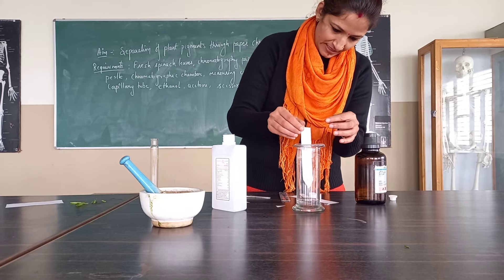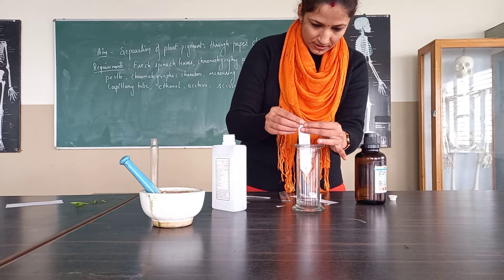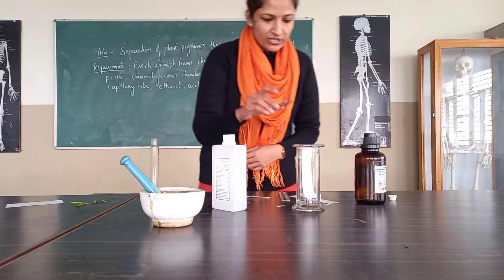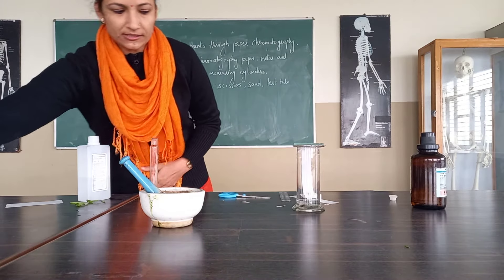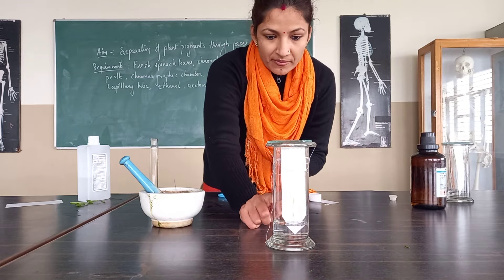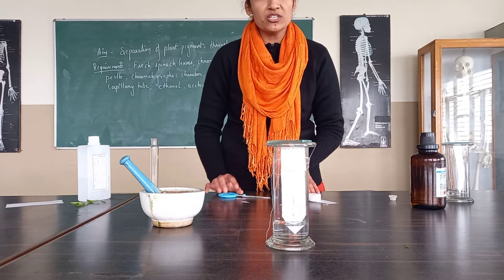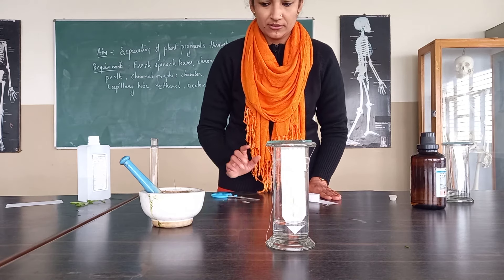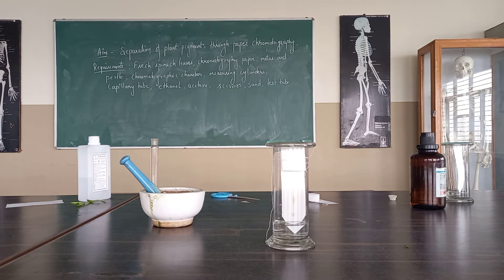We will see the length of this, mark accordingly, fold it, and we will place the watch glass also. We will rest it for 20 minutes. After resting, we will be obtaining the result like this. This is the final result — we have obtained the different pigments. You can see the yellowish one and the greenish one. In that way, all the pigments present in the leaf of the spinach get separated. This is the method by which we have separated the components of the pigment of the plant. Thank you.